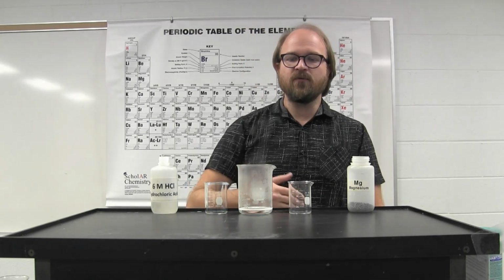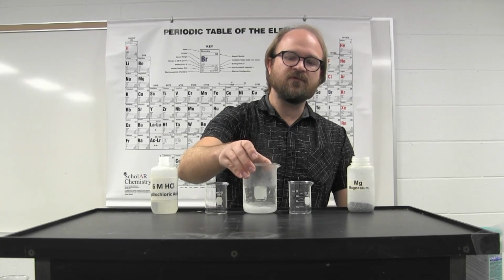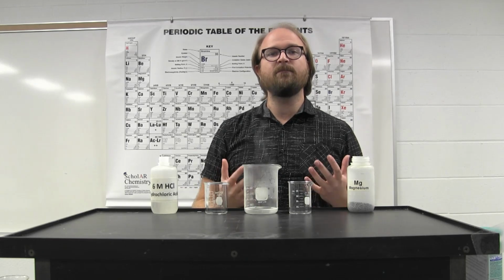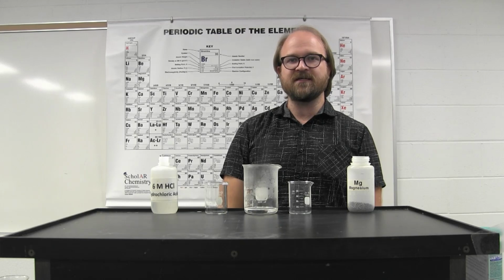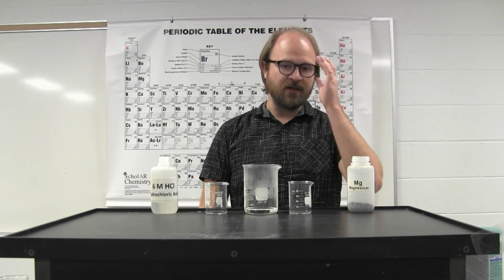So when going through and calculating different things, if you were to do this based on numerical values, how many moles of hydrochloric acid was there to start, how many moles of magnesium was there to start, you can figure out what the limiting reagent is, how much of it was there, and how much of the other thing was there as well.